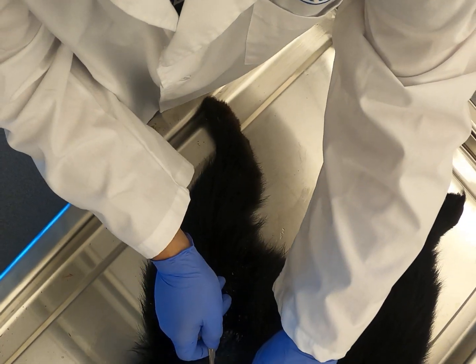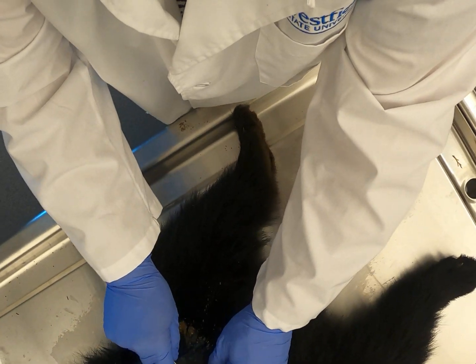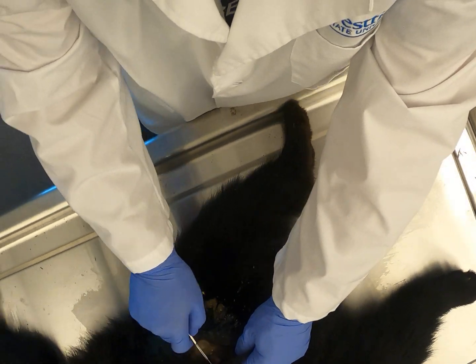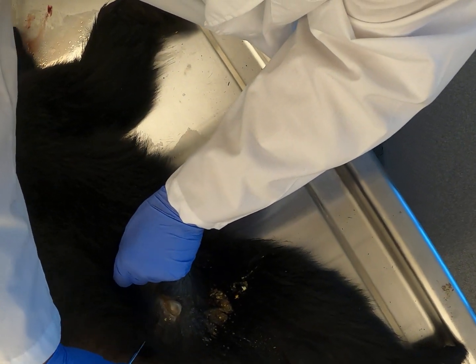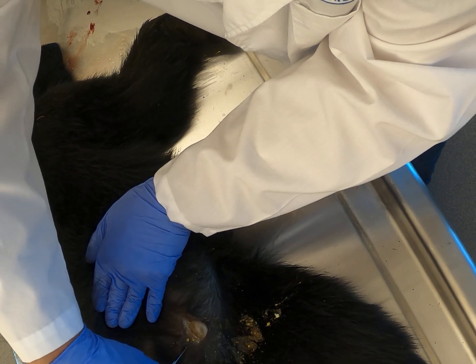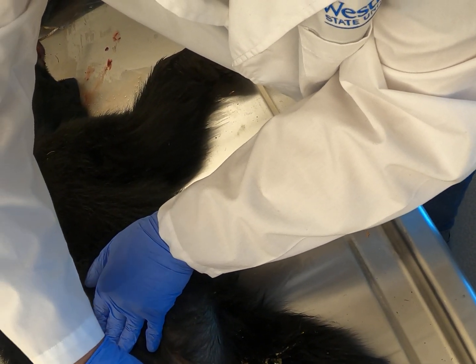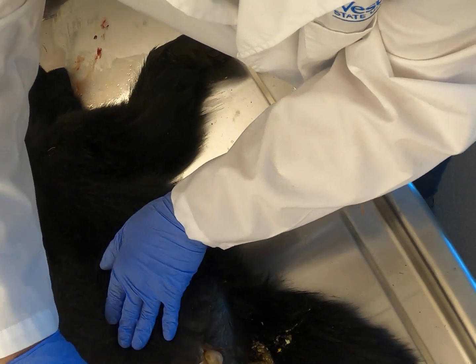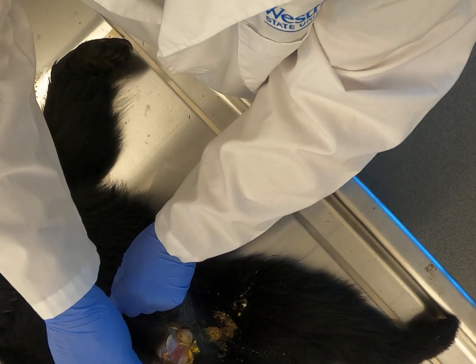I'm going to go into the abdomen with a sharp scalpel and cut a little bit lengthwise. I'm going to get out of the way just in case something comes squirting out — there's a little bit of material.